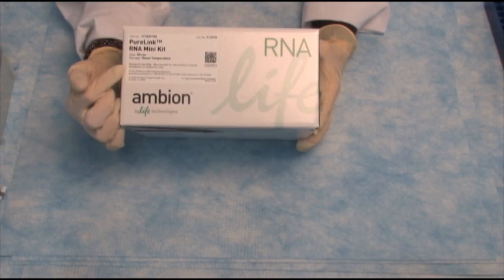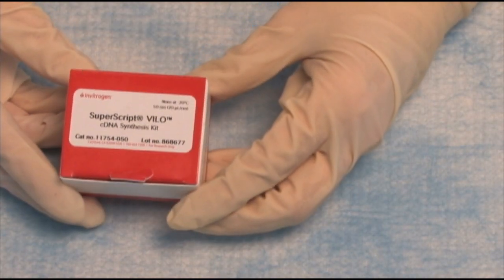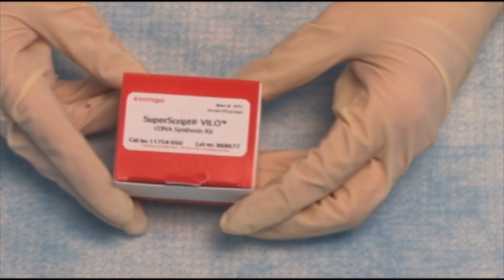Let's make some cDNA. We've isolated our RNA, we quantified it, and we know what its quantity is. Let's make cDNA. In order to do this, we are going to use the SuperScript VILO cDNA synthesis kit.